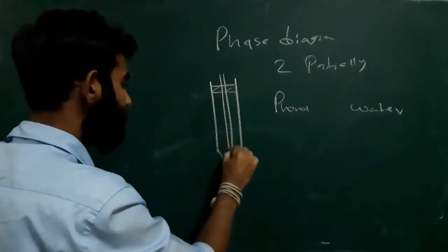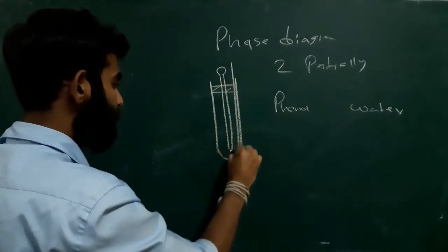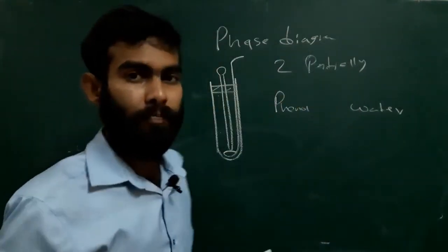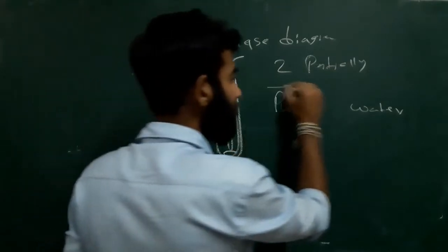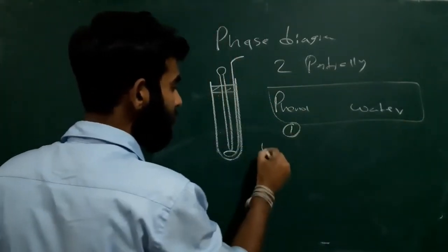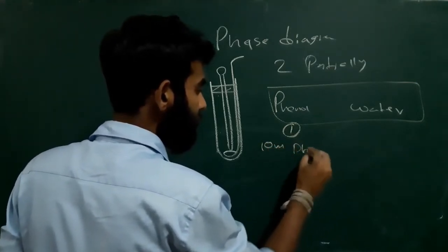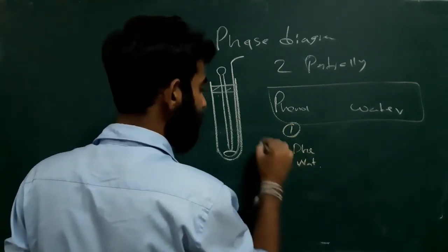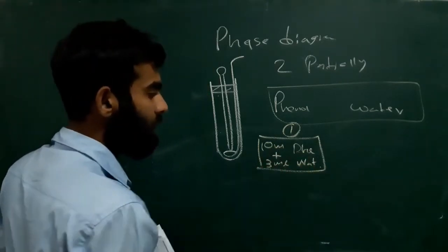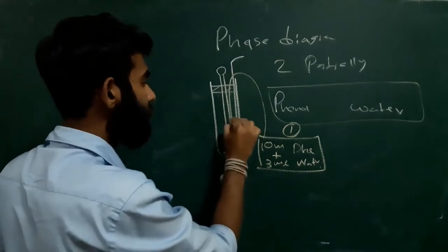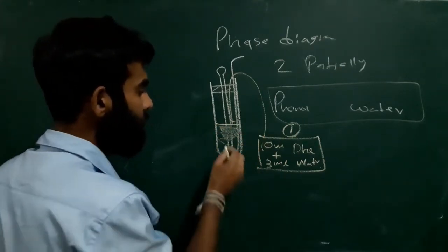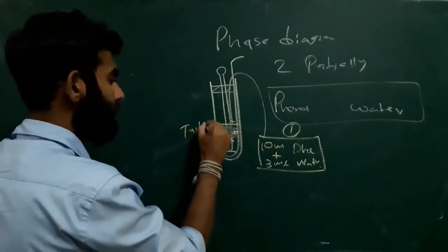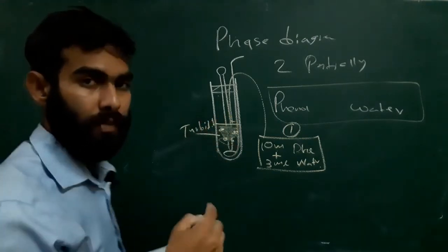We will add a stirrer. There are two sets of experiments in this phenol and water system. In the first set, we will use 10 ml of phenol and 3 ml of water, and we will add these into the boiling tube. Initially, we can see turbidity in room temperature.